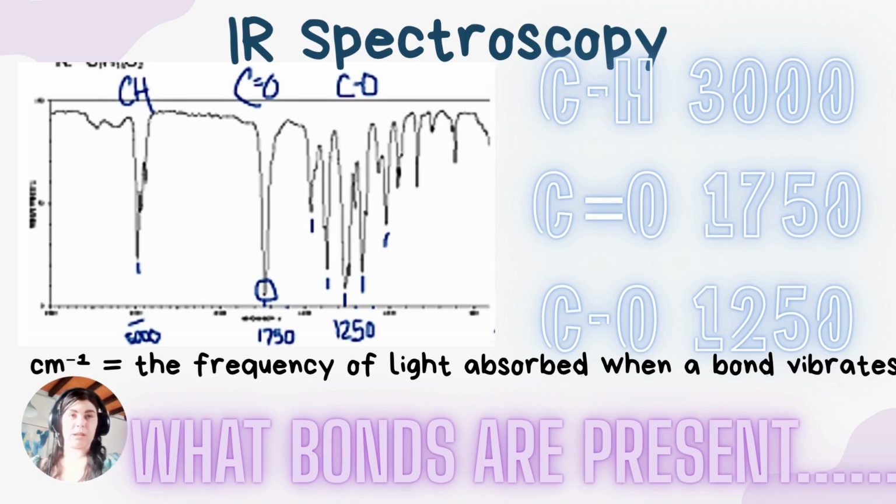We're going to move on to the next type of results that we need to analyze in order to get closer to determining which molecule this is. Here we ask ourselves with this result, what bonds are present? As you can see, we've identified 3 major bond types and 3 major functional groups as well from the signatures of the spectroscopy. Next, we're going to take a look at the second process.